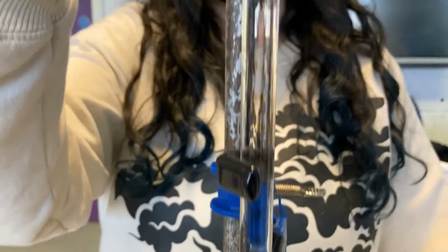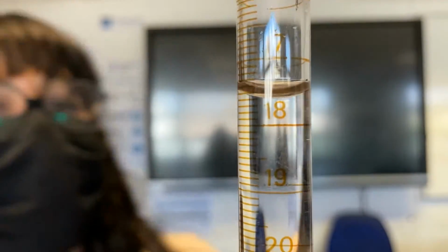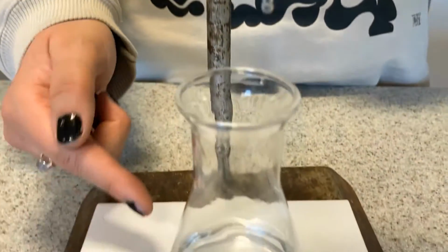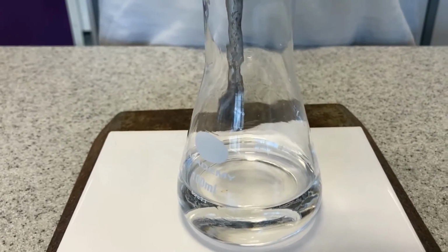So let's pan up. And you can see here the meniscus. And the bottom of the meniscus, if I can read it rightly backwards, which I can't. Can you read it, sir? Yeah, it's just above. So that's about 17.5. So we need 17.5 millilitres of acid to neutralise 25 millilitres of 0.1 molar sodium hydroxide. Got the white tile, made it a lot easier for us to see the colour change. Sorted.